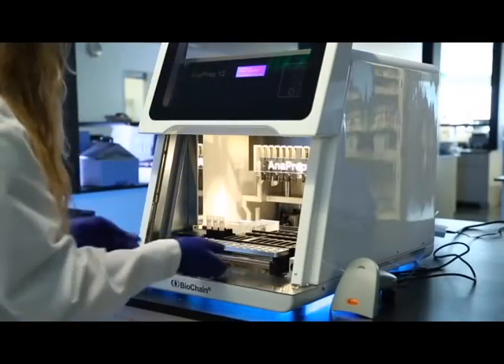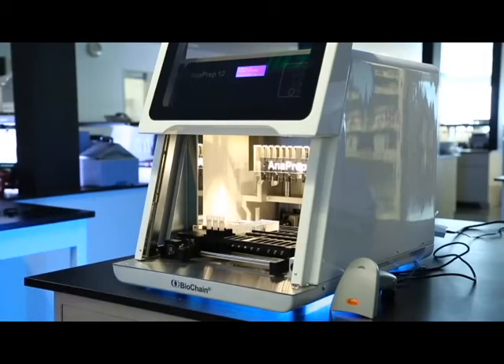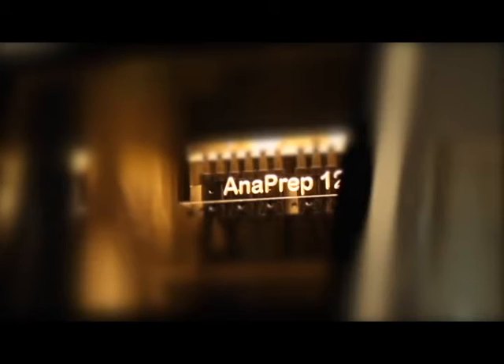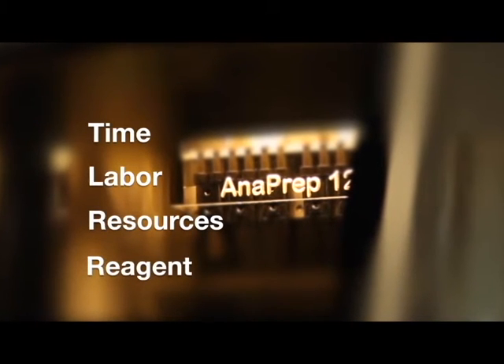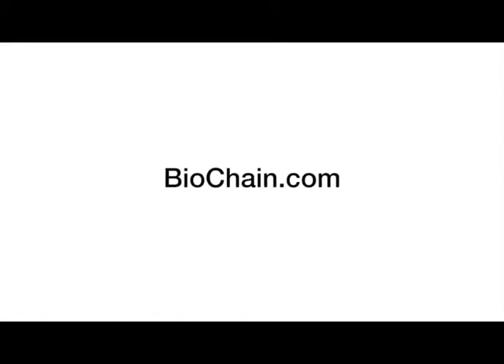Once Anaprep is done, there is virtually no cleanup required — no need for O-ring grease maintenance or liquid waste bin disposal. It's that easy. This all-in-one unit saves you time, labor, valuable resources, and reagents. Anaprep does all this without compromising quality. Please visit biochain.com for more information.